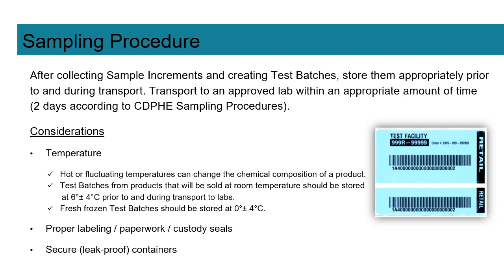After collecting sample increments and creating test batches, store them appropriately prior to and during transport. Transport to an approved lab within an appropriate amount of time, 2 days according to CDPHE sampling procedures.